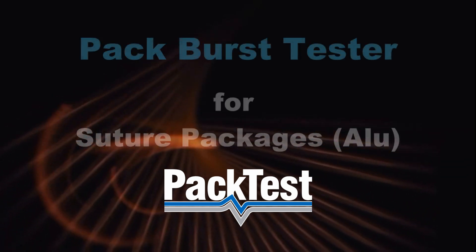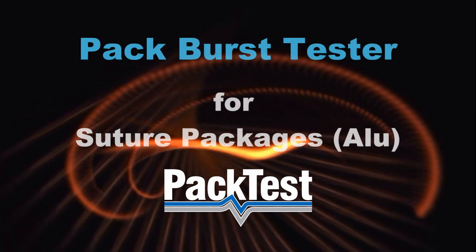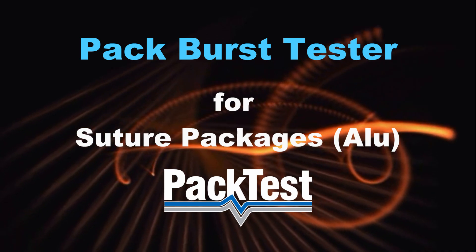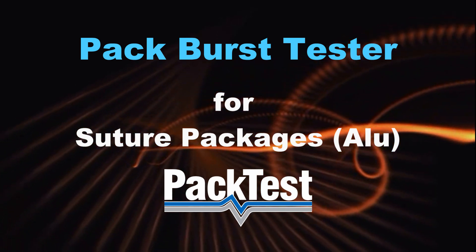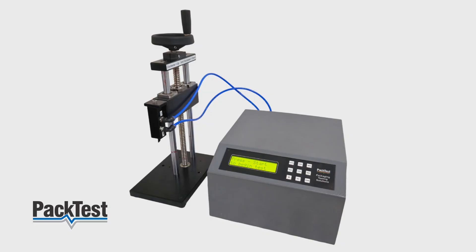This is a video guide of Pack Burst Tester for Aluminum Suture Packs. This product is manufactured by Pactist Machines, India.